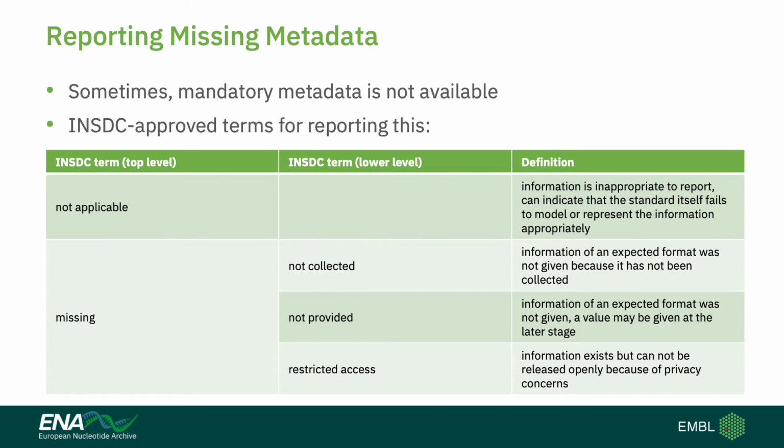So in some cases, for a mandatory field, perhaps you haven't collected it or you're not privy to this information. We do have a system for reporting missing metadata, which is INSDC approved, which means it's a system that's applicable not only within ENA but also NCBI and DDBJ.